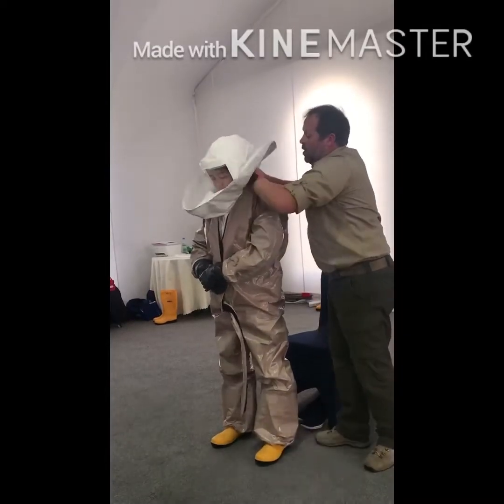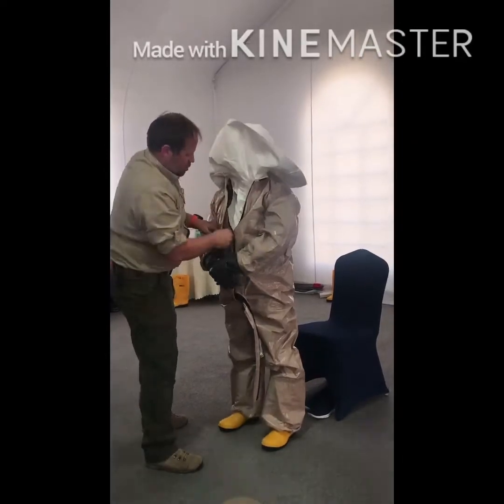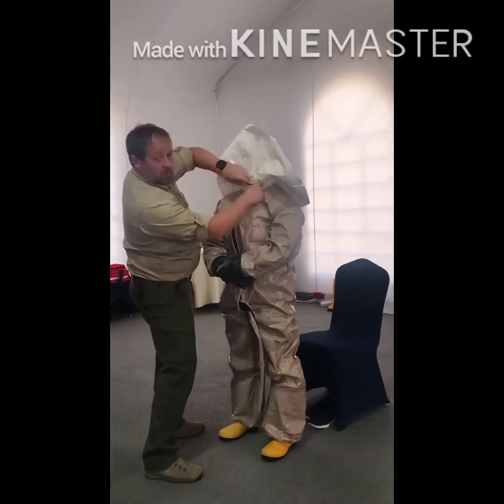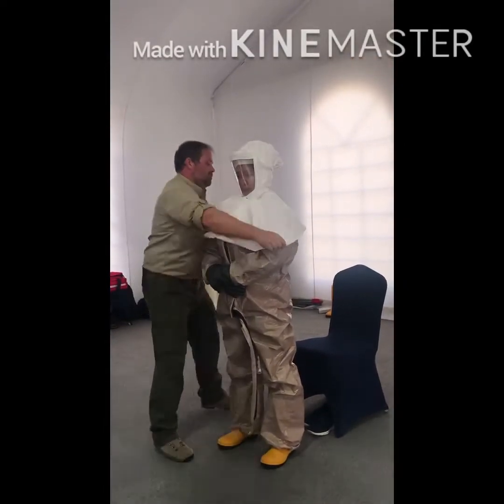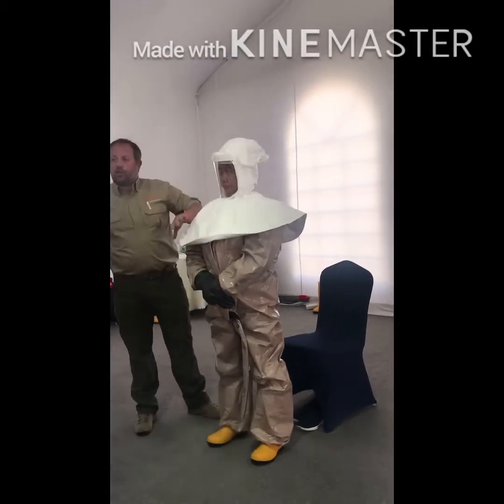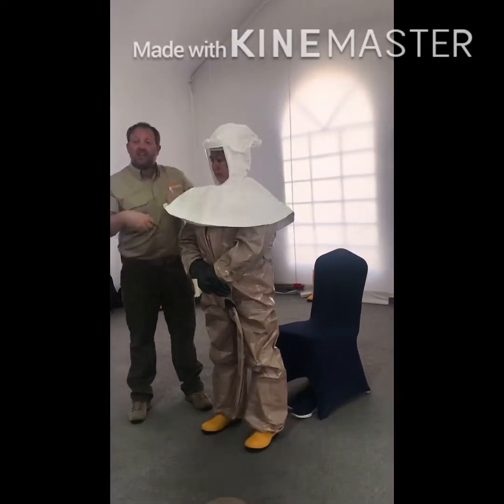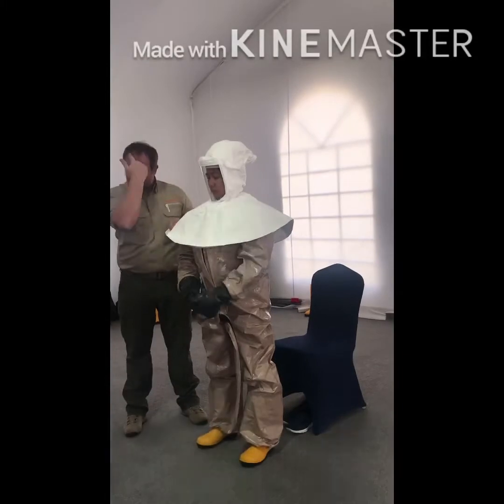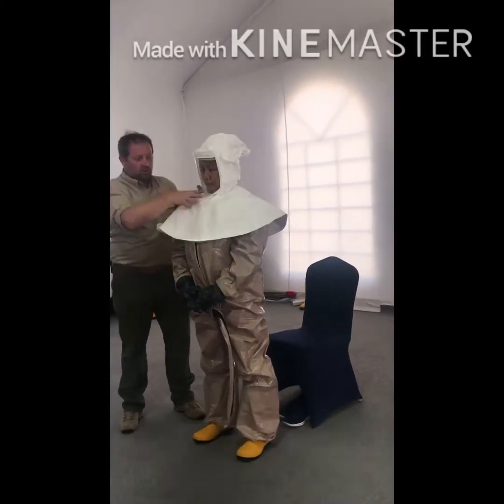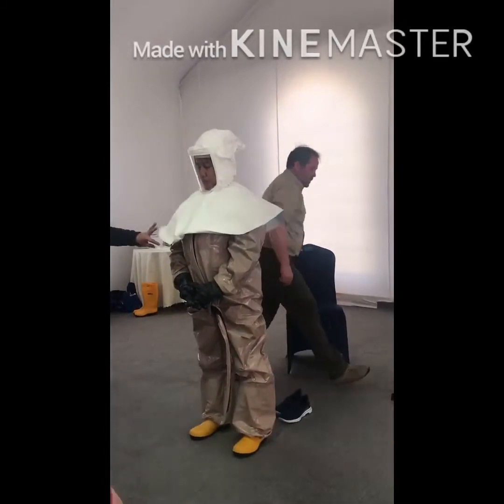So, once that's inside the suit, I can now zip the suit all the way to the top. I can cover up the Velcro. I pull down, like so. What that's going to do is when the PAPR goes on and inflates, along with the head strap, it's going to keep it in place. It's also, if anything drips on you, it's just going to drip down there rather than into the suit. It's double layer protection.